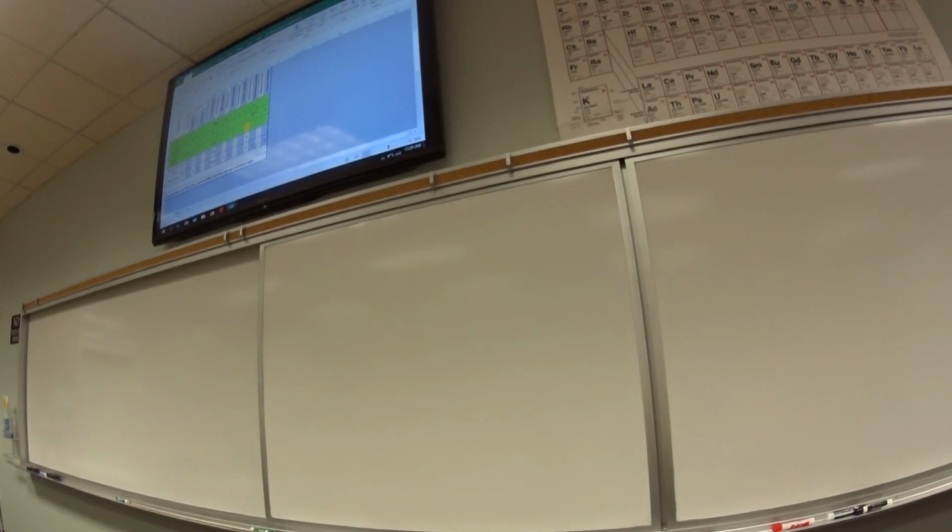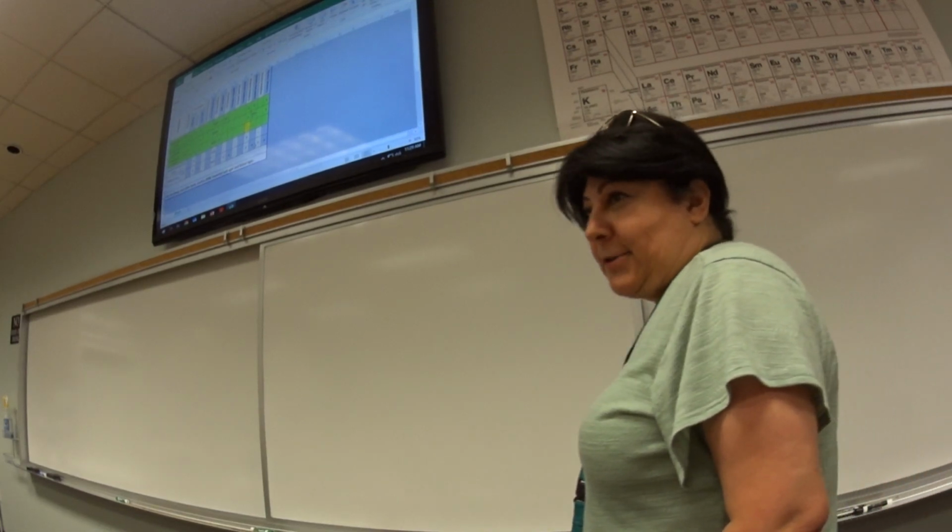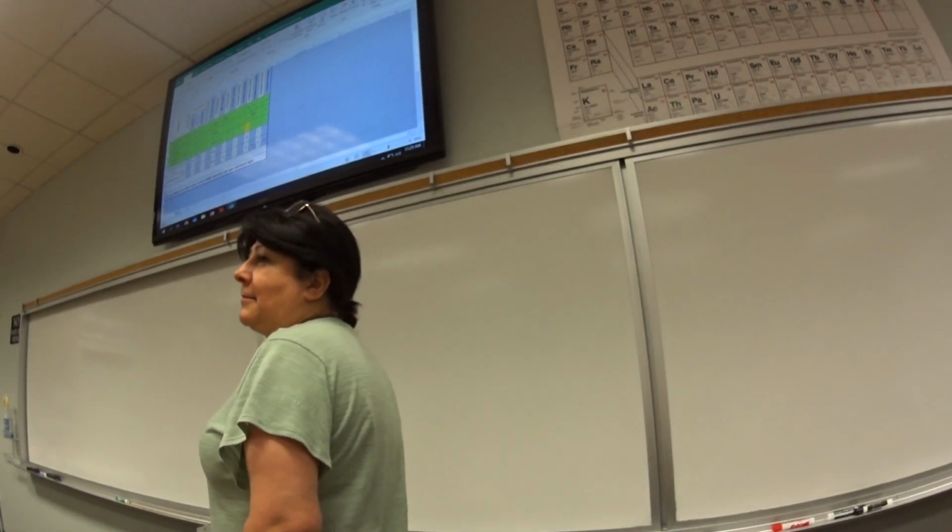What else is good for Staphylococcus aureus and epidermidis? What can I order that it's not there? And it will give me a result after incubation. Crazy result. Mannitol salt. Mannitol salt, yes.